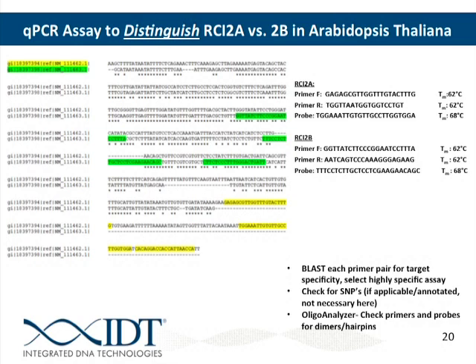And actually, you can use thermodynamics programs to calculate mismatch of that. What you would see is that the TM for that probe to lay down on that unintended target... Would it just be two less bases on each side? No, probably wouldn't make a difference. There's no way thermodynamically that probe is going to be able to lay down.